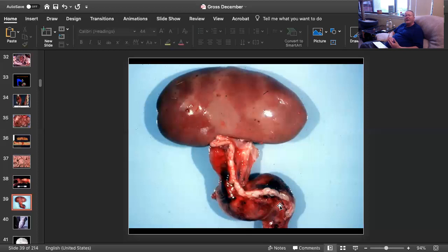The other thing that I would give serious consideration to would be that this entire thing is the ureter. Maybe there's a little bit of fat. I don't think that's the case, but it's certainly worth a consideration. And there are some very nasty organisms that cause cystitis, ascending ureteritis, and ultimately a bad necrohemorrhagic and suppurative pyelonephritis in pigs.